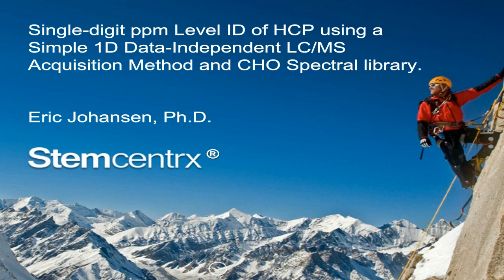Again, my talk is going to be entitled Single-Digit ppm Level of Host Cell Proteins Using a Simple 1D Data-Independent LC-MS Acquisition Method Utilizing a CHO Spectral Library.